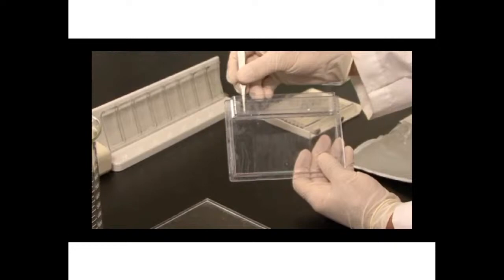Working quickly, use your forceps to push the IPG strip against the gel to push out any air bubbles. Agarose is going to solidify fairly fast. You can see the agarose filling in the place of the bubbles as they get pushed to the top. Small air bubbles are not an issue. Try to get some of your larger ones, and you should not have any problems for your second dimension gel. Now that the agarose is solidified, I'm ready to run the gel.